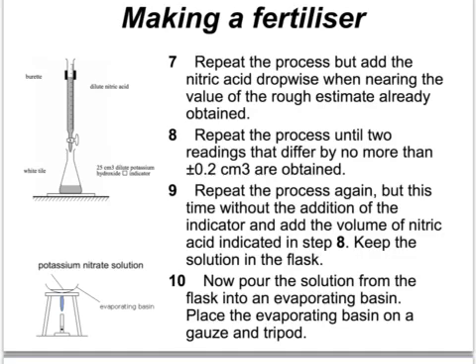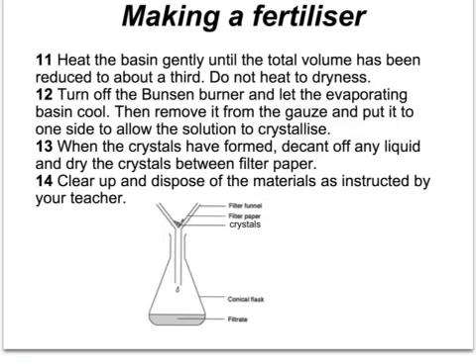To make crystals we need to drive away the water. We transfer the solution into an evaporating basin and warm it on a Bunsen burner. When most of the water has evaporated and crystals start to appear, we stop heating and allow the basin to cool. As the temperature decreases, the solubility of potassium nitrate decreases and more crystals come out of solution. We then filter off the crystals and dry them between dry filter papers, giving us crystals of our fertiliser, potassium nitrate.